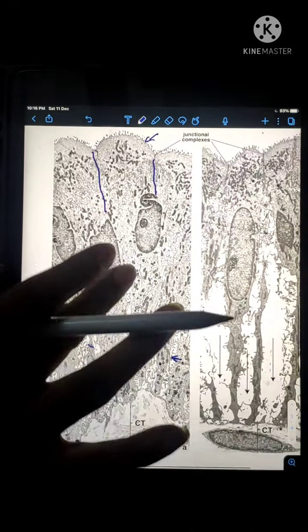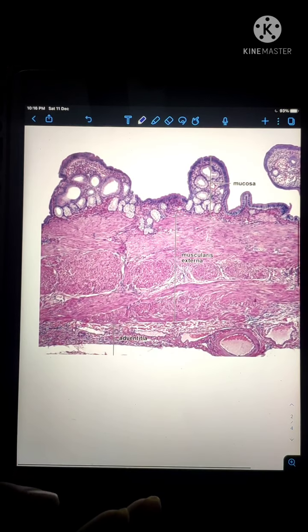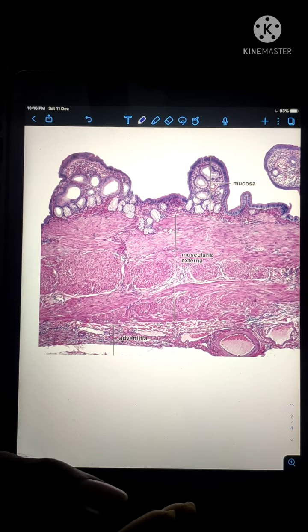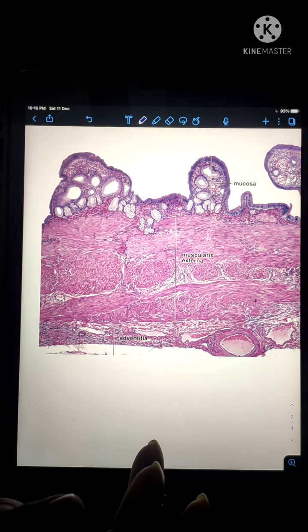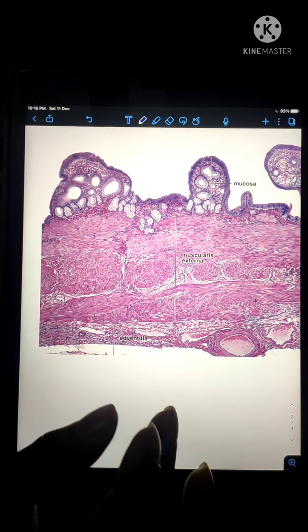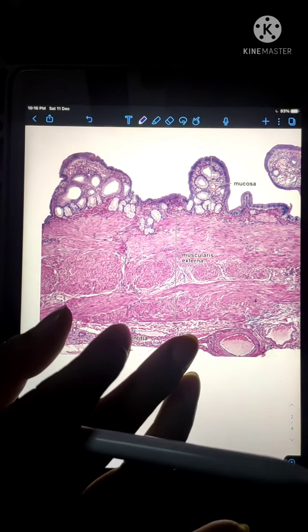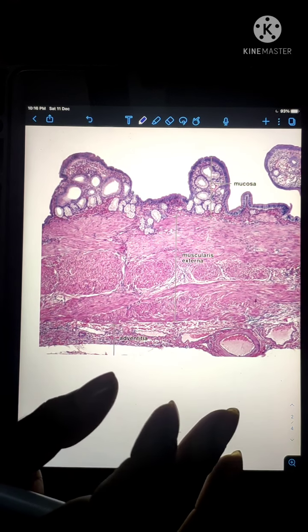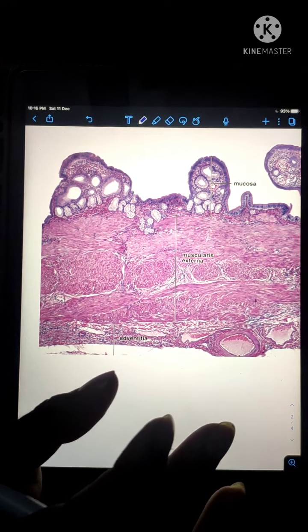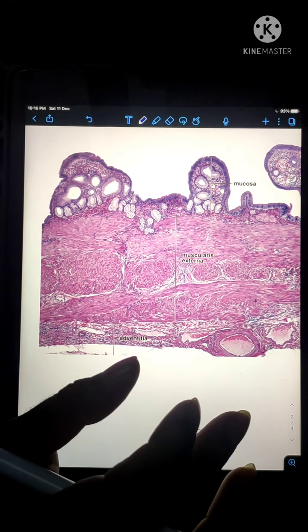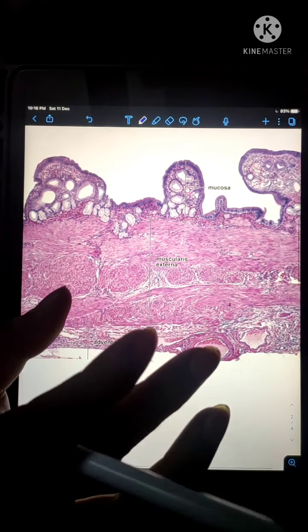The second portion of the mucosa is the lamina propria. The lamina propria here is composed of connective tissue, but it has no lymphatics. It does have other features of connective tissue such as blood vessels and autonomic nerve endings, but it does not have any lymphatics.